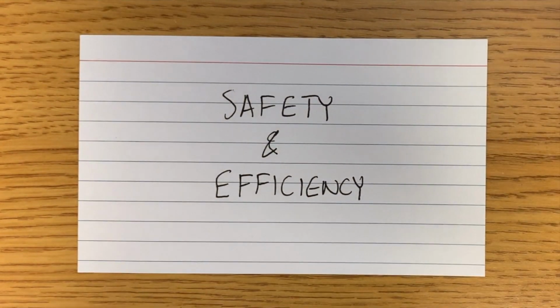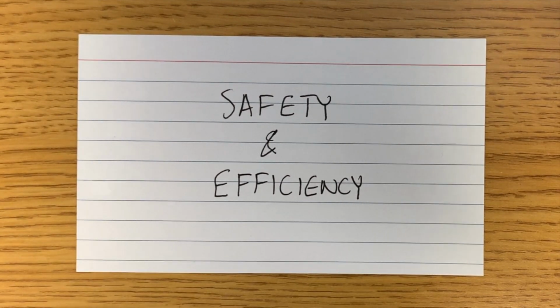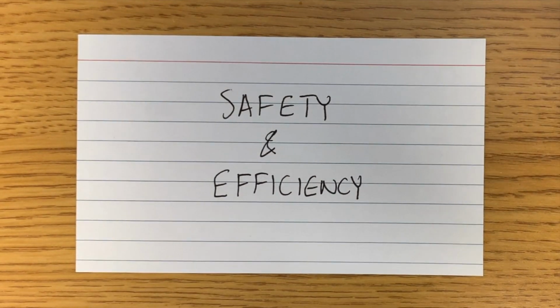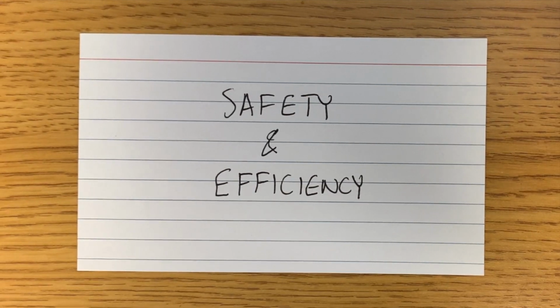As always, remember to handle all the reactants and products with caution and follow all the safety guidelines. And in terms of efficiency, you can always plan out your titration ahead of time and determine everything that you do know about your solutions and what you're looking for, and that will help save a lot of time.